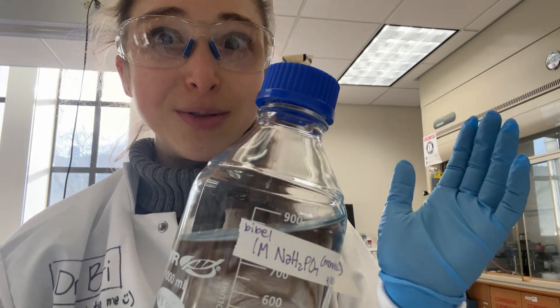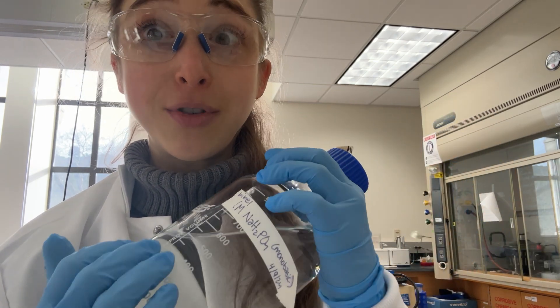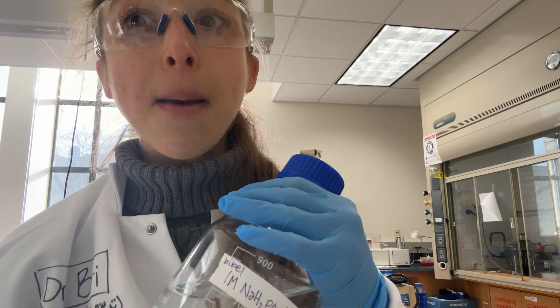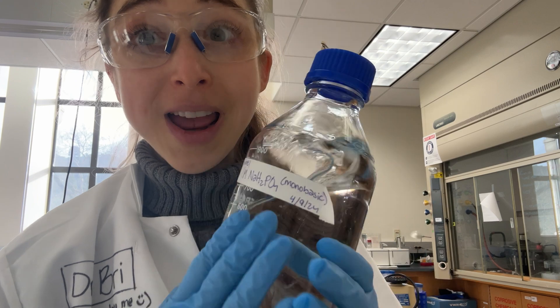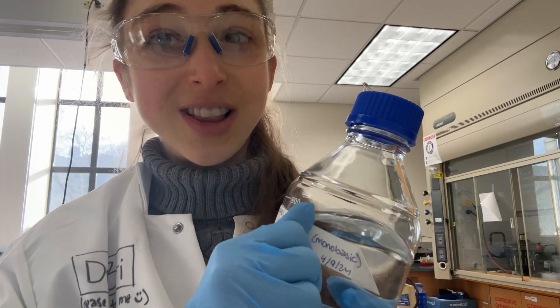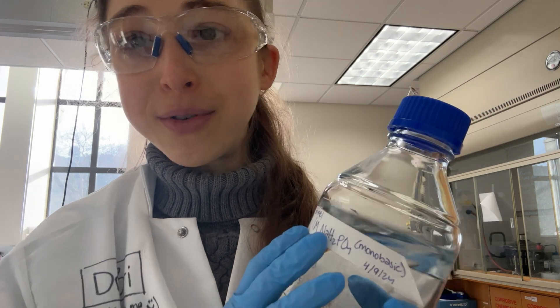Sometimes you want to make sure the tape does stay on. If you have soapy liquids and things like that, make sure the bottle is dry before you put the label on. It may seem silly, but when you're in a hurry you rush a label on and then realize the label's halfway off.